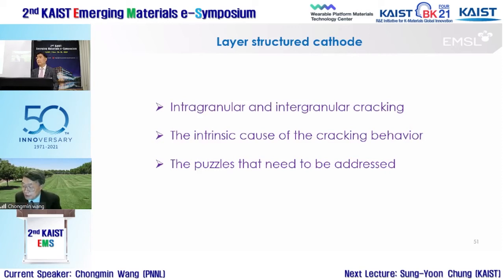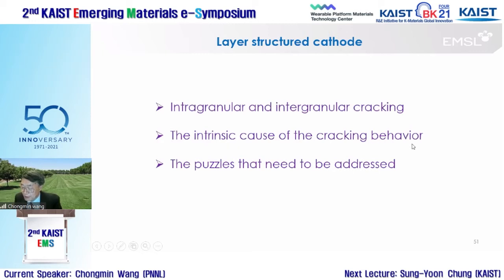Intragranular and intergranular cracking is a very common phenomenon. There are a lot of challenging questions that still remain. What's the intrinsic cause for the cracking behavior? The community simply calls it cracking. I think there's some puzzling thing still going on there, and I think we illustrate what's really going on.